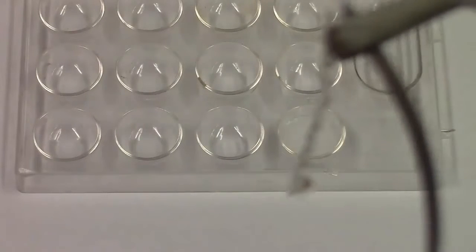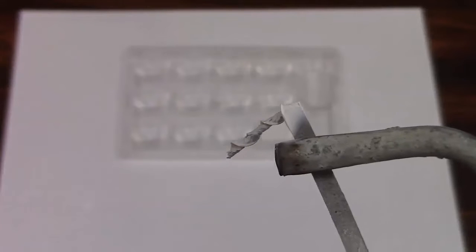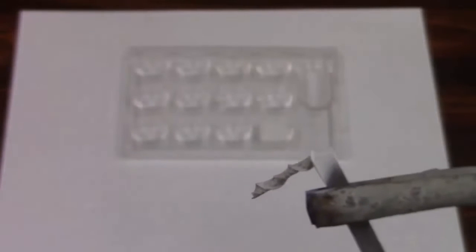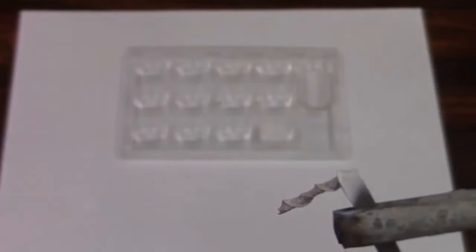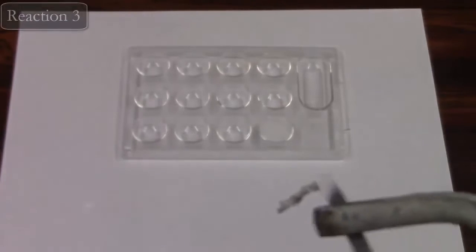And then really closely have a look at what's been left over on that magnesium ribbon. Seeing here, it looks like some white powder has been formed. What could that mean was produced?